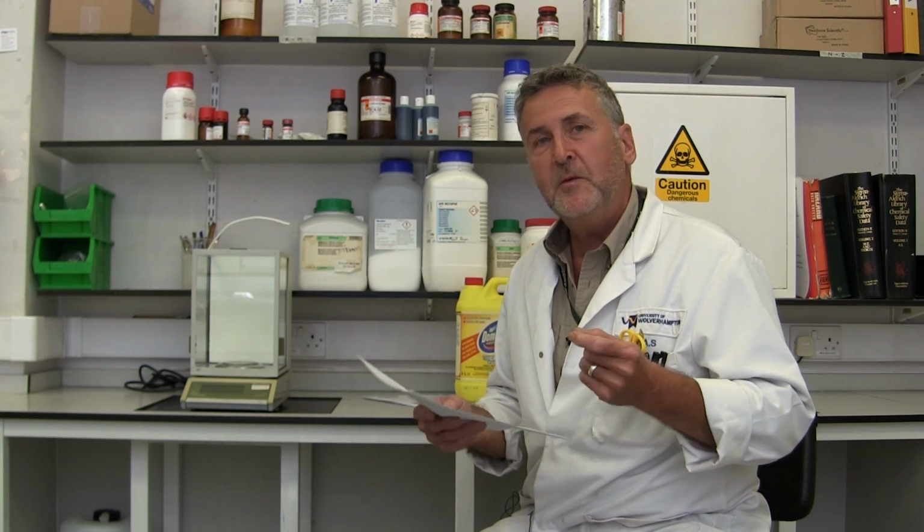Firstly, what do you want that amount for, and where are you going to store it, and in what? These are questions we have to take into account. Logistics is a part of doing CoSHH simply because we don't have the space to store huge quantities of things. And what are you actually going to be doing? Remember that many of the projects that we have to contend with students have been done before in some form. Maybe not exactly the way you're going to do it, but we have an idea because it's been done before.